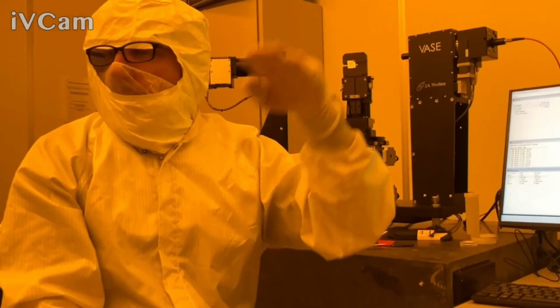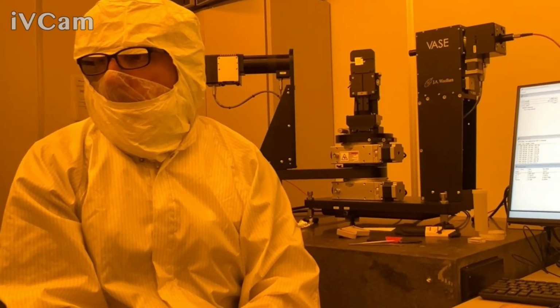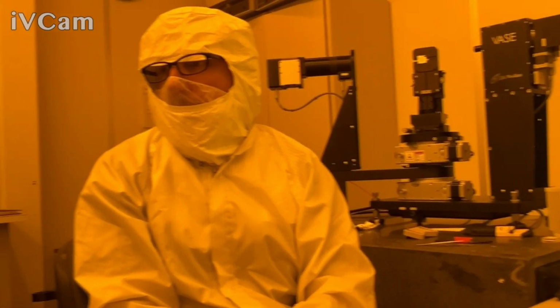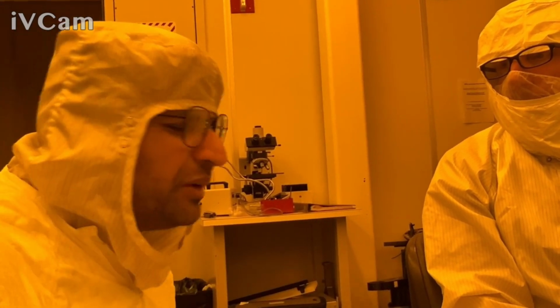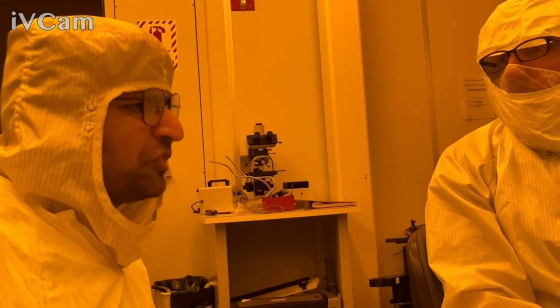But what's your material that's a couple microns thick? What is the material? Your film? Mainly dielectric. Let's say if we grow the thin film from CVD or PVD techniques, roughness is not an issue. Over there, surface smoothness is very good.